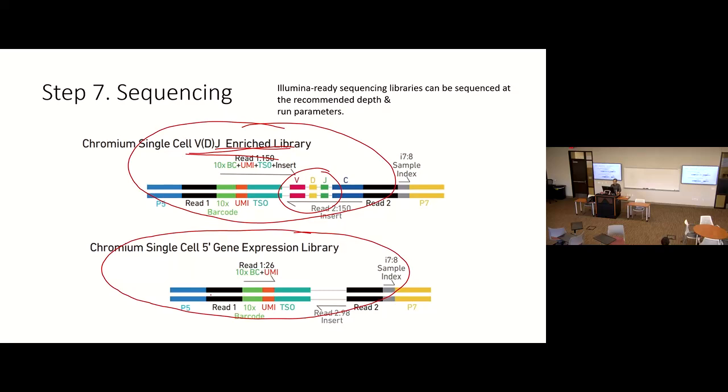Here, this tells you where this gene is transcribed, so this gave you the count of genes. Here gave you the sequence of this region. It's not a count, it's just a sequence.